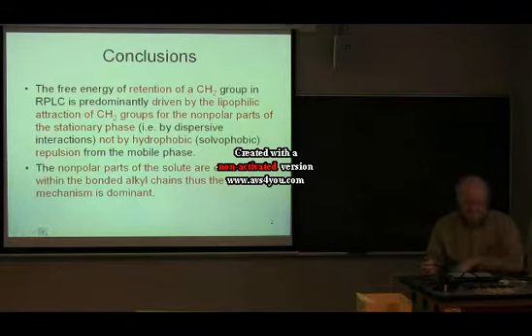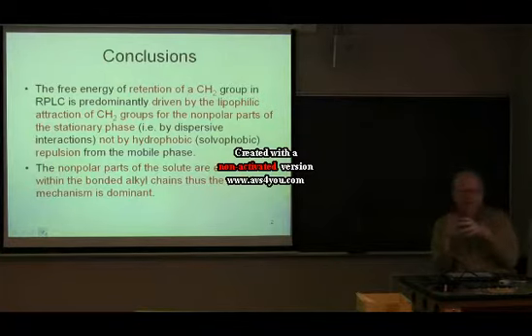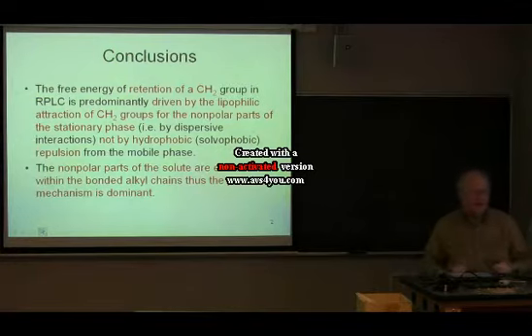The second part of the conclusions is that the nonpolar parts of the solute become embedded within the bonded stationary phase. That the nonpolar parts become surrounded by the C8 or C18 or phenyl group, whatever, that's on the stationary phase.